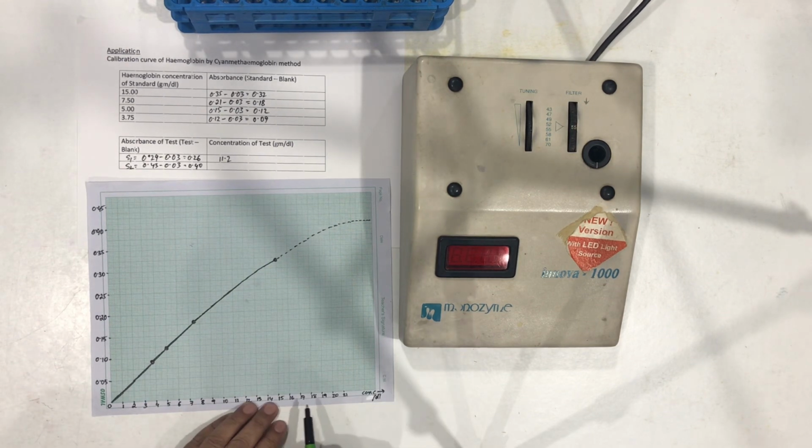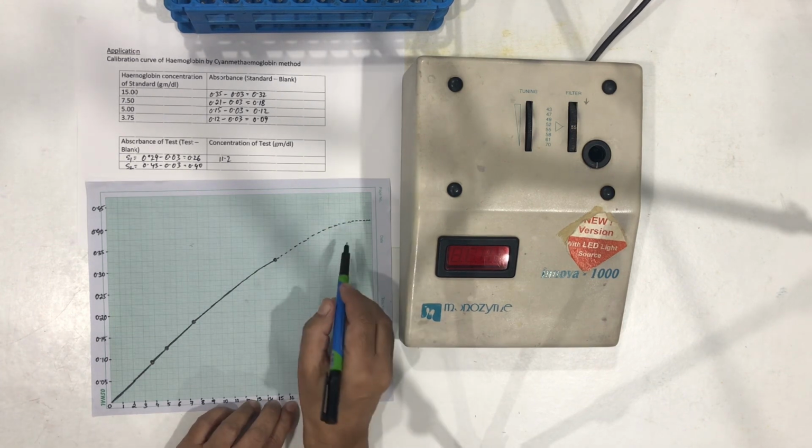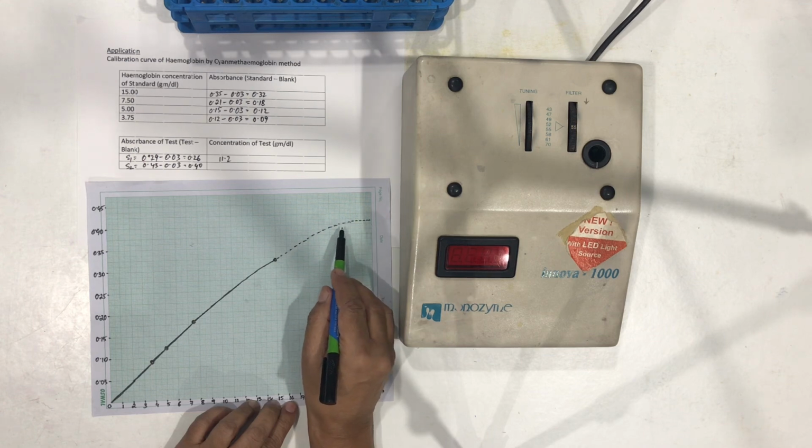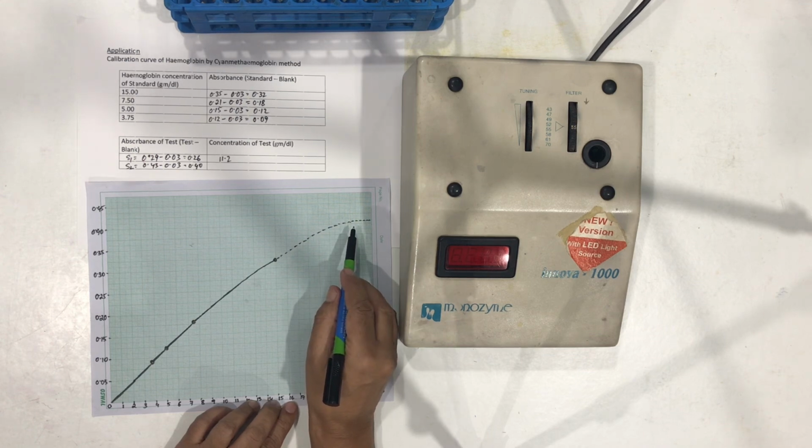Though you keep on increasing the concentration here, the absorbance almost remains flat out here.